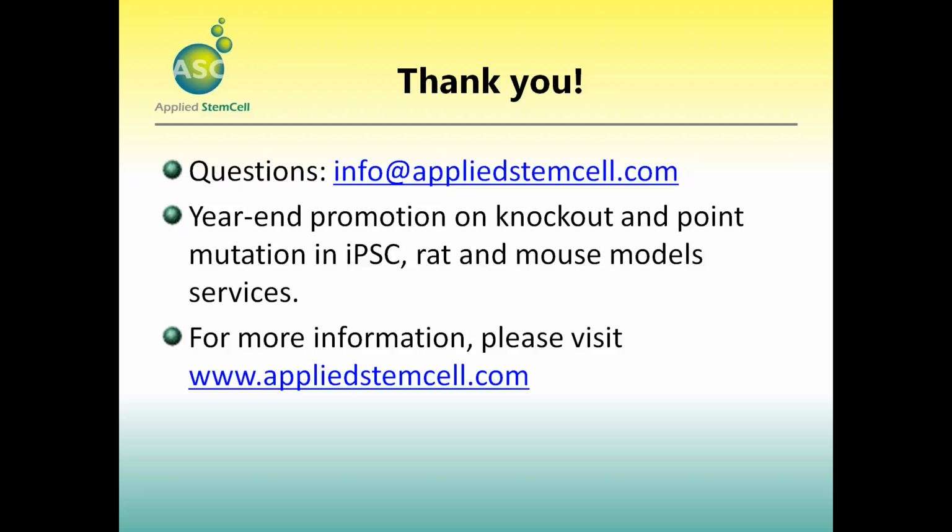Okay, and looks like there's one more question here. How many times can cells be passaged after iPS gene modification? Okay, this is a little complicated question because the answer really depends on the initial status of the iPS cells. So if we use patient-derived iPS cells, normally they grow relatively slowly and are prone to differentiate.